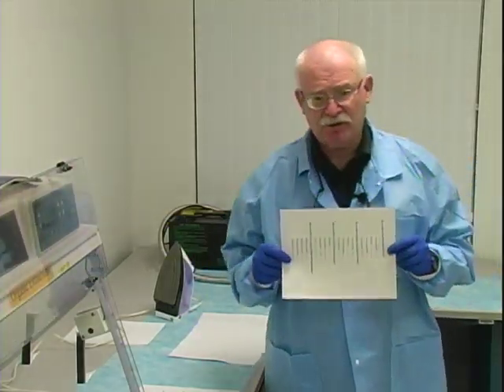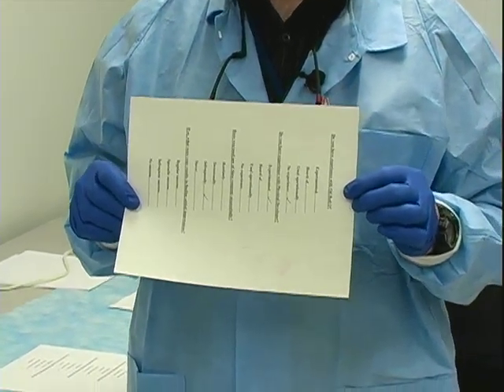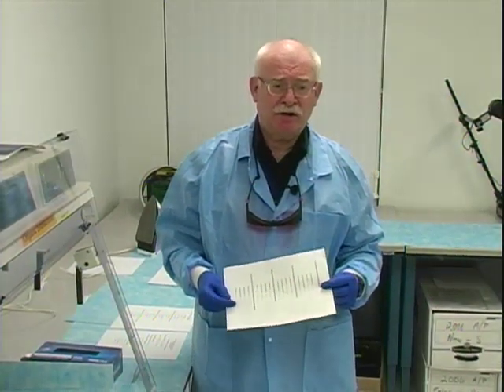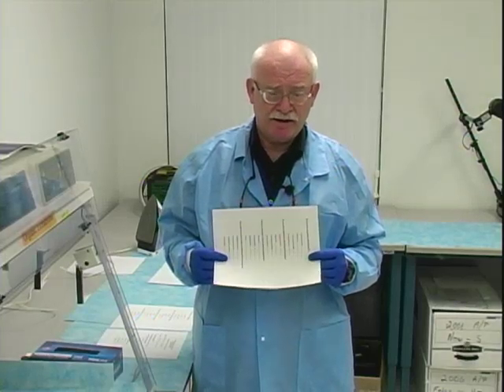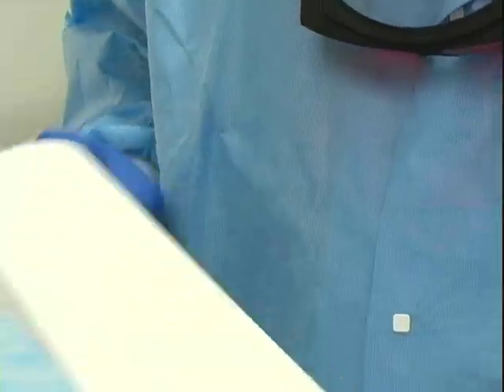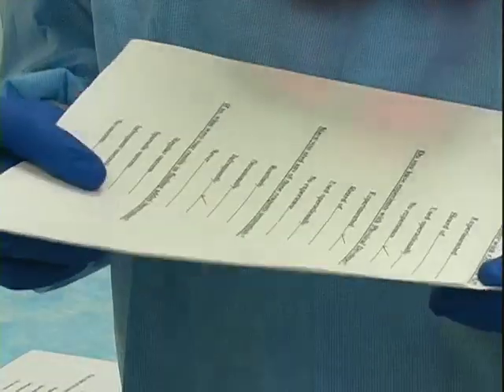We have processed the first exhibit. We can see that there is a visible color change indicating impressions have been deposited and developed on the paper. It must be said, however, that indanedione does not have, in my experience, as strong a color mode as either ninhydrin or DFO. But at the end of the day, that's not what we are interested in anyway, because the fluorescence is much more sensitive and has a much longer reach than simply staining the print with color. This visible color is merely an indication of promise.